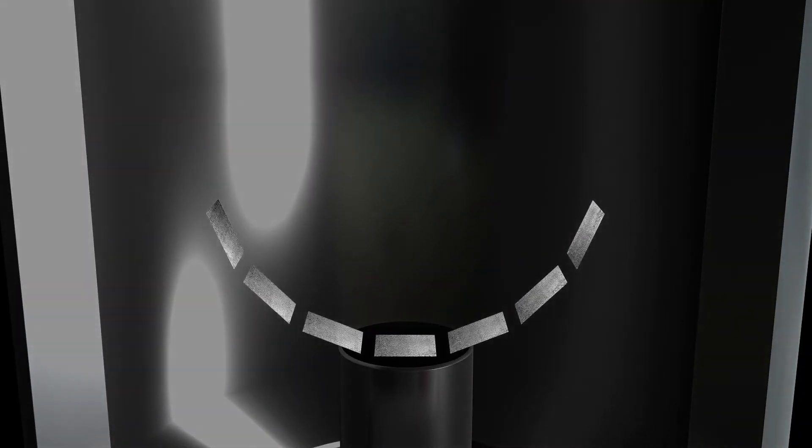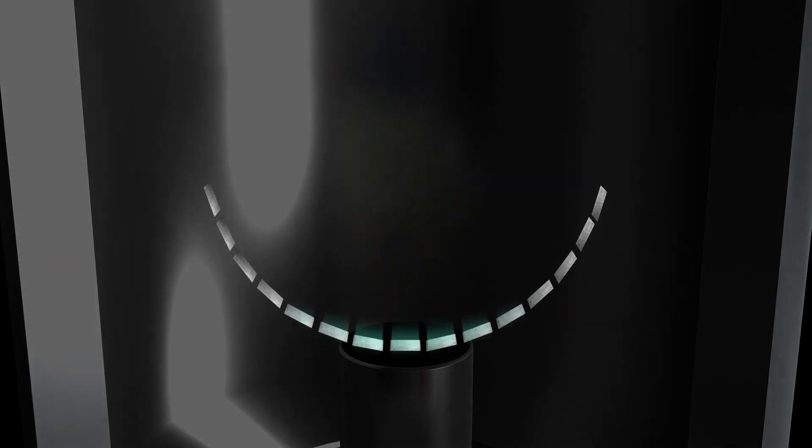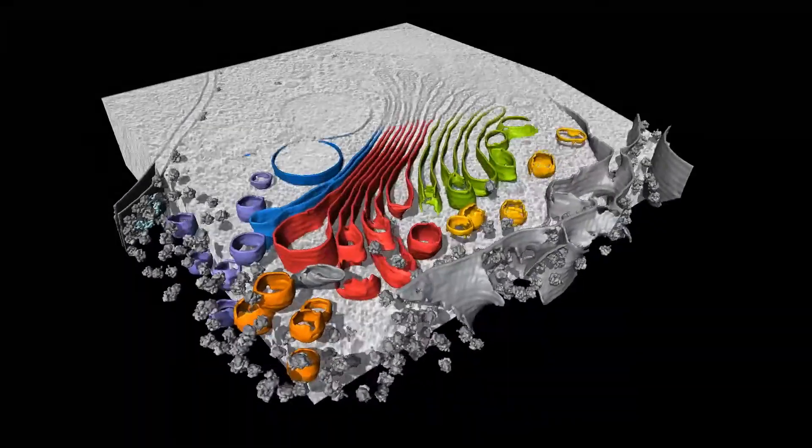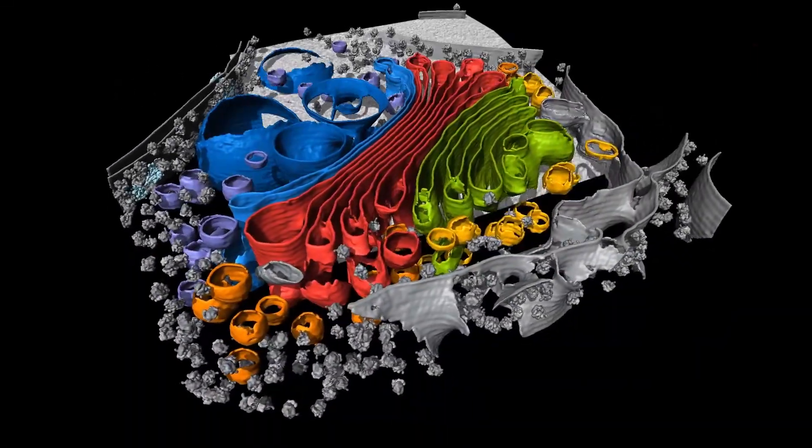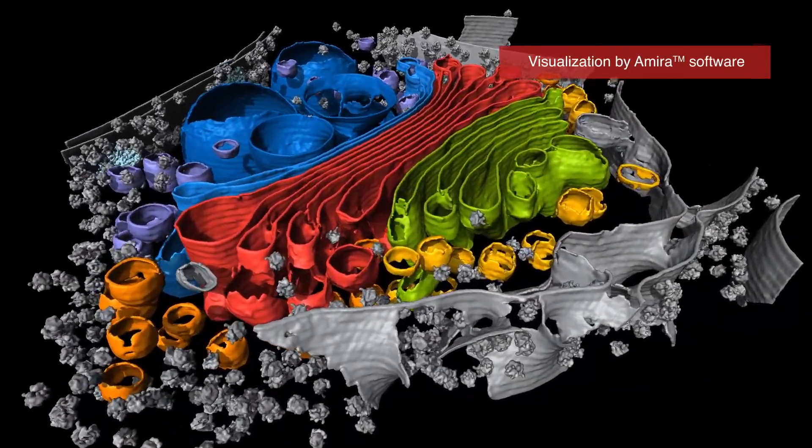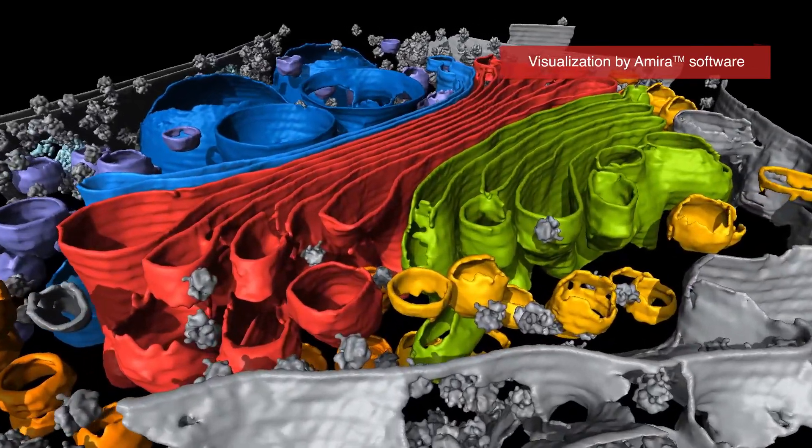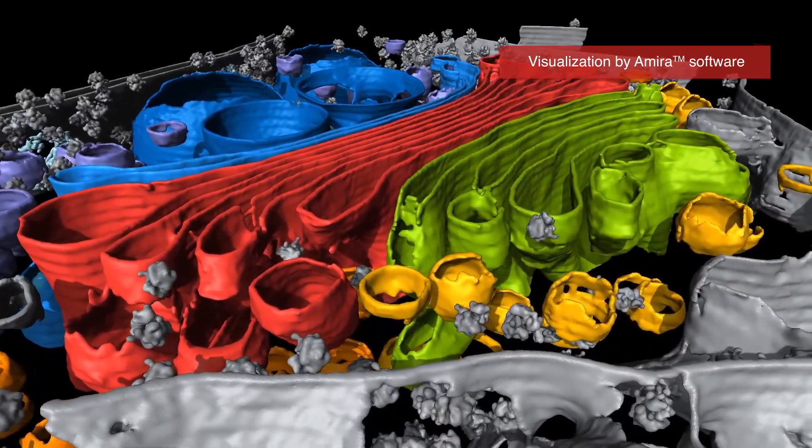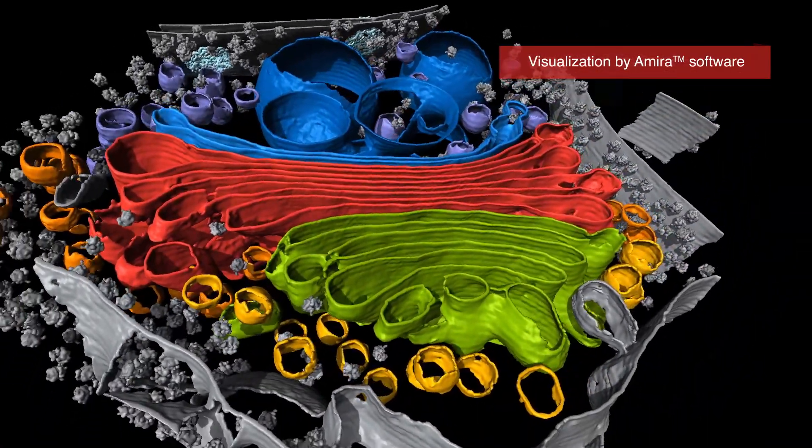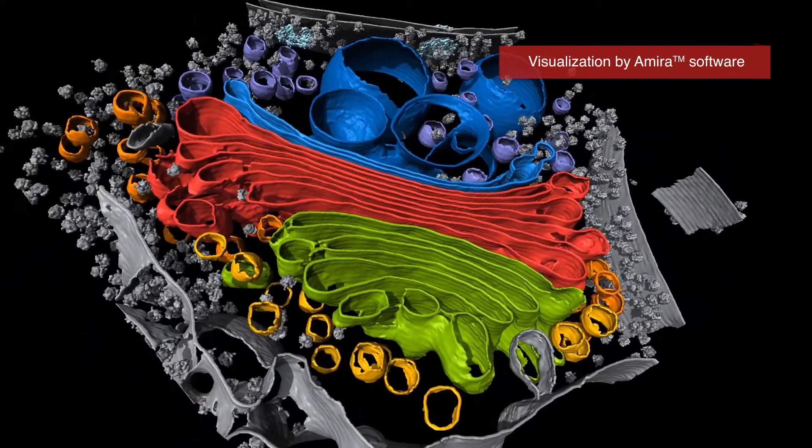Finally, the images are combined by computer into a 3D tomogram. The tomogram is a snapshot of the preserved hydrated cell interior where protein structures can be explored in their native environments.